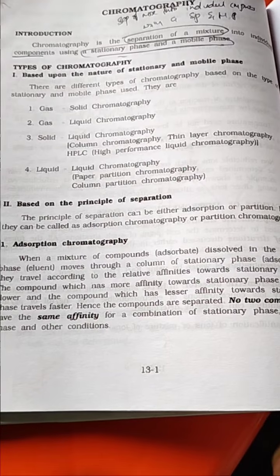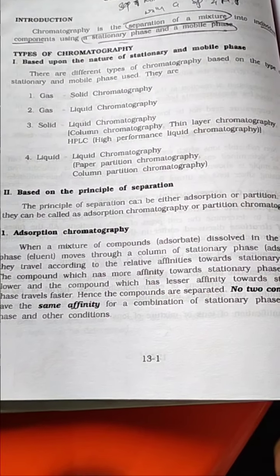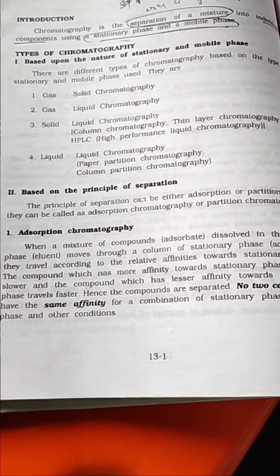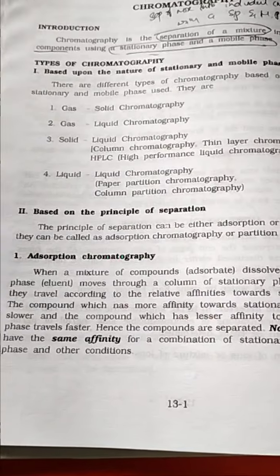Types of chromatography. Based upon the nature of the stationary and mobile phases, the types are classified as gas solid chromatography, gas liquid chromatography, solid liquid chromatography, and liquid liquid chromatography. In solid liquid chromatography, column chromatography, thin layer chromatography, and high performance liquid chromatography are subtopics. And in liquid liquid chromatography, paper partition chromatography and column chromatography are there.